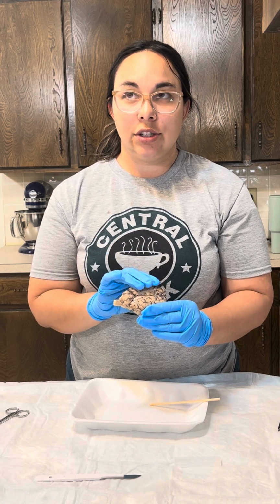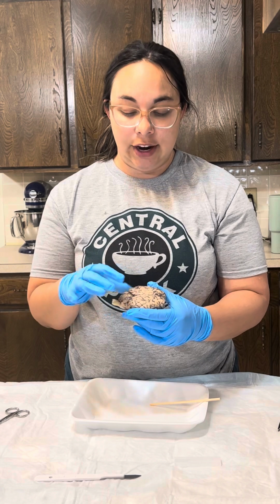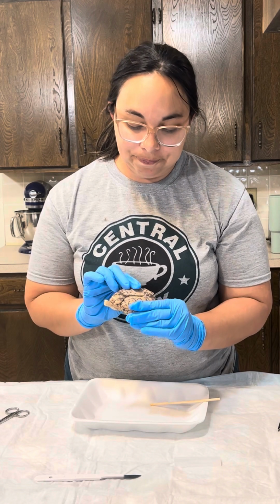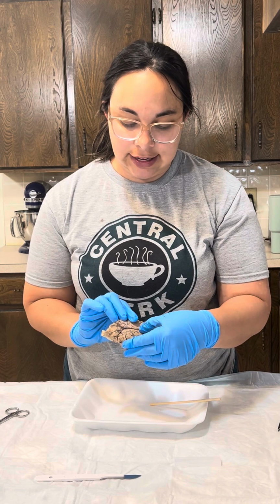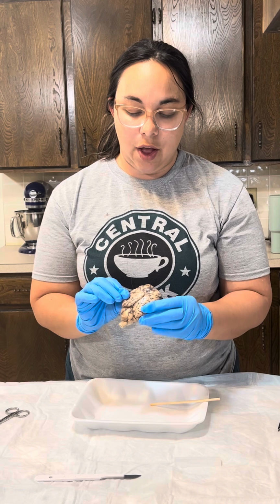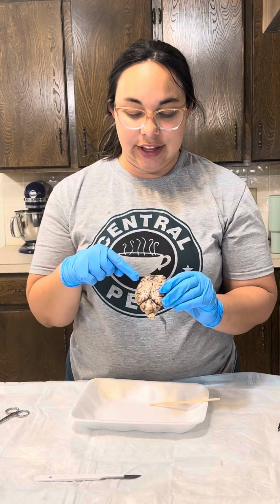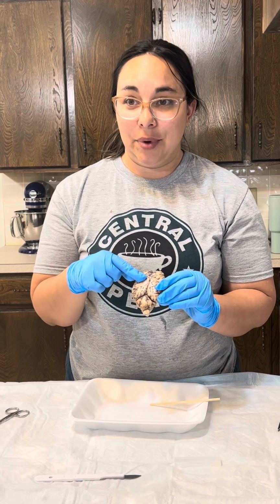The cerebrum is divided into two parts, the left and right hemisphere. And between them, you can see there's a little line here. This is a deep, so I'll back up. The brain has ridges on it. As you can see, there's the black ones and the white ones.